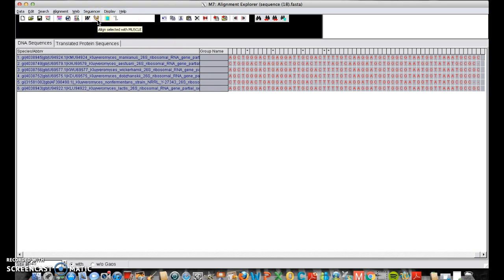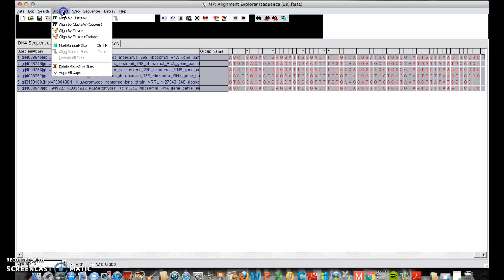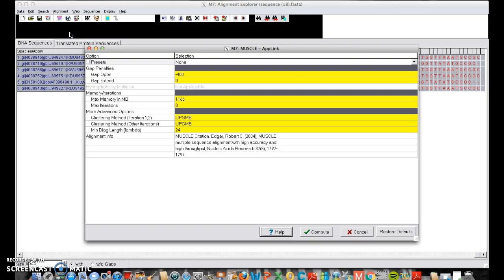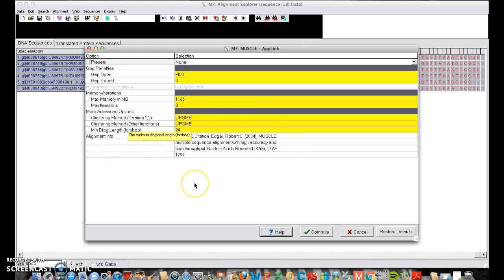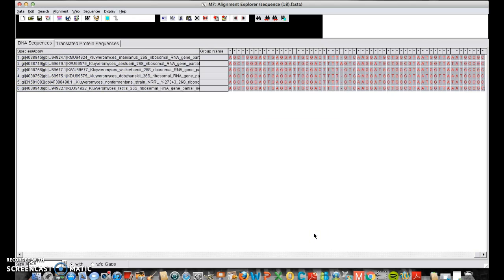We're going to use the muscle alignment tool. Most softwares have a couple of different ways to skin the cat. This one is no different. You can choose this icon, the arm with the muscle. Or you can choose alignment, align by muscle. That's what we need. You'll see this screen that tells you some presets. And it also gives you some citation information of where the math came from to line this up. And now we want to compute. So this is going to do all the work for us.